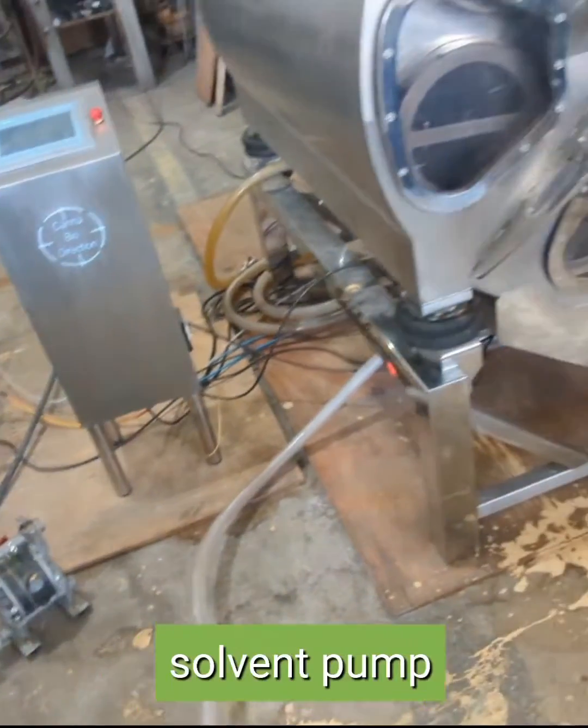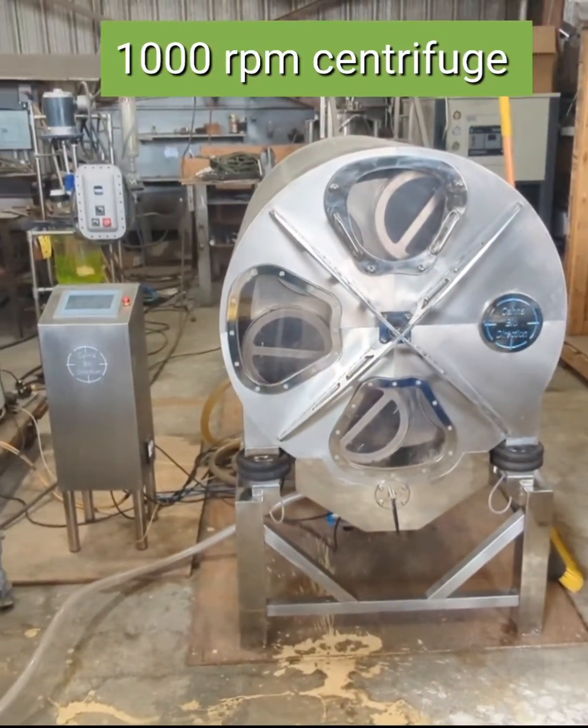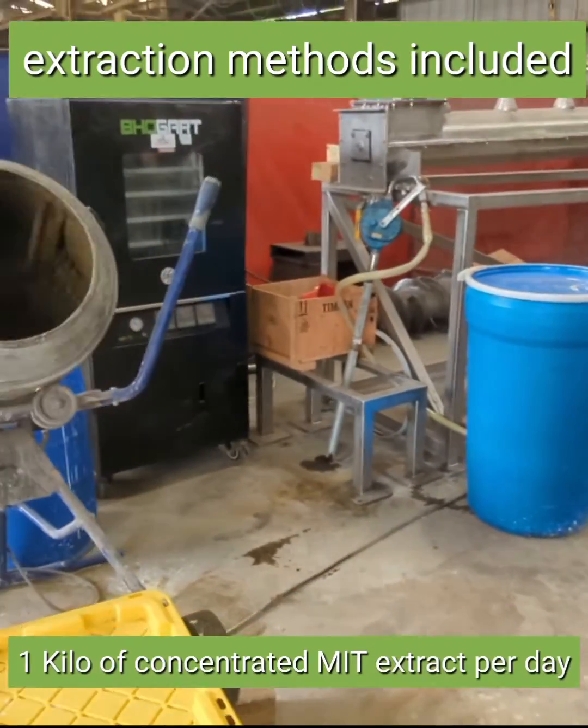You just need a little diaphragm pump and some piping or some hose. Right here is all you need to make a good kilogram of kratom per day.